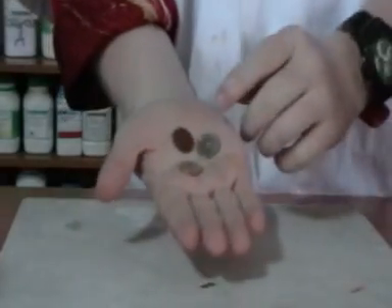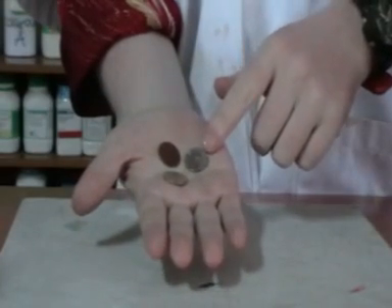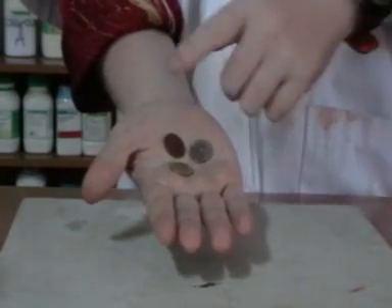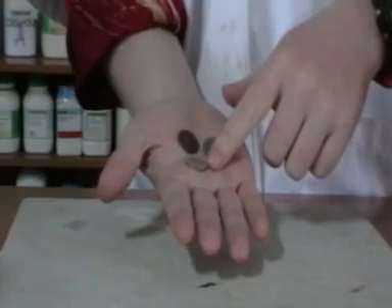Today I want to show you some magic in chemistry. I want to show you how we can change copper coins into silver coins and then into gold coins. Here you can see there are three coins: the copper coin, the silver coin, and the gold coin. What I want to show today is how to change from a copper coin into a silver coin and then into a gold coin.